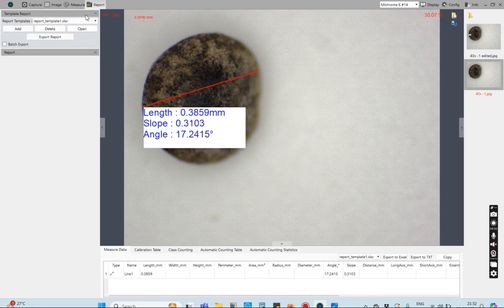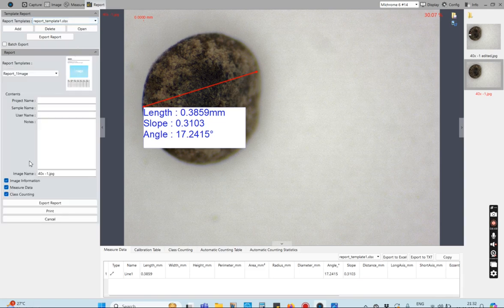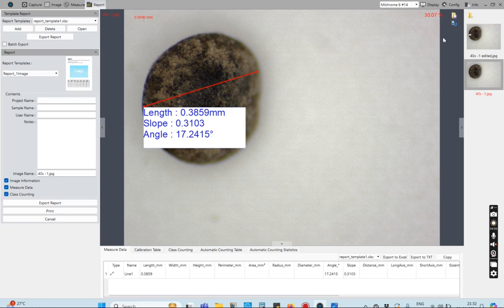If you click on Report, there is a standard report template that takes the image and all the readings and generates a PDF file. If you require that, you can use the report function, which is available by default. I hope that helps — thank you for listening.